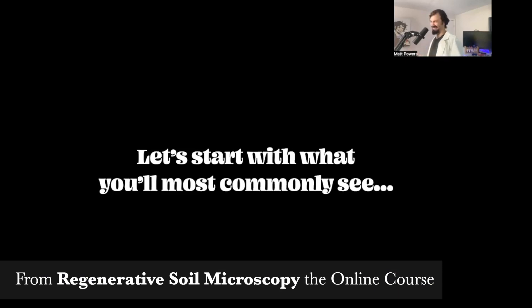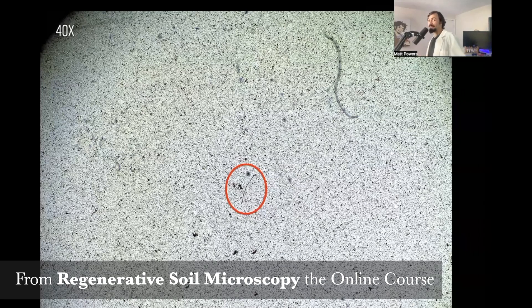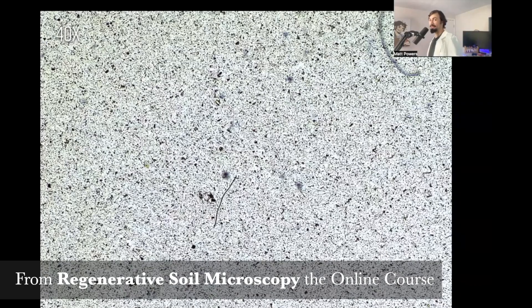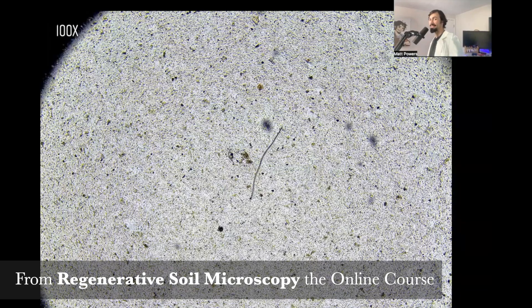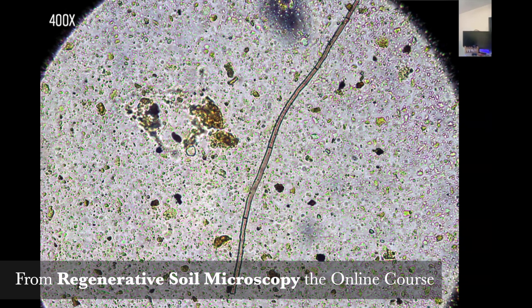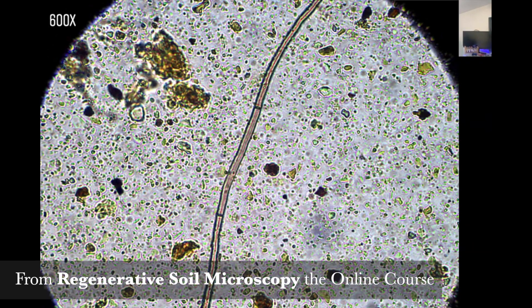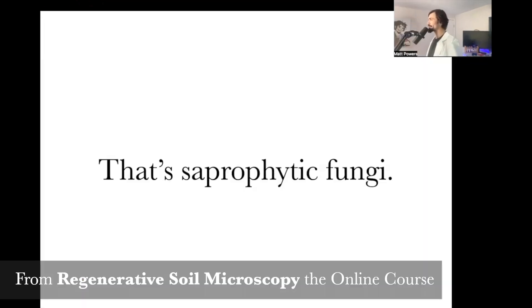Let's start there because this is at 40x. You'll see these little root-like things, these dendritic things, these twig-like, stick-like things. Let me zoom in — at 40x, this is 100x, this is 400x. You can start to see the structure, the morphological characteristics, and even more so at 600x. But that's saprophytic fungi.